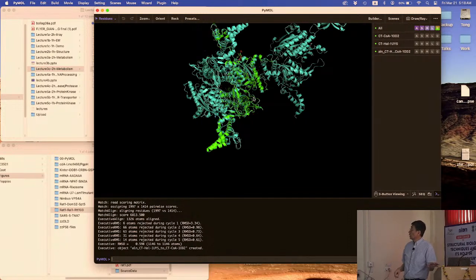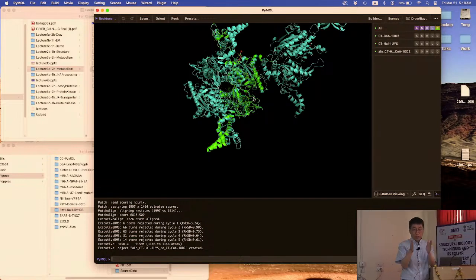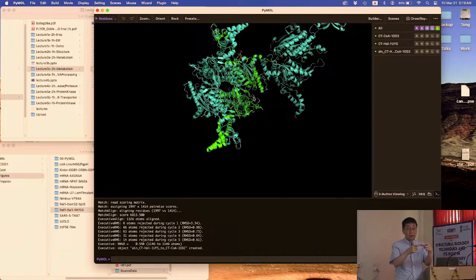Okay. So CT is a dimer. So when you overlay two structures, you overlay a dimer against a dimer. What I like to do is overlay a monomer onto a monomer. That way, any difference, one molecule will be exactly the same or very close to being the same. Any change will be more visible. If you align a dimer to a dimer, you average out the difference. So each change is a little bit smaller, right? You see what I'm saying?